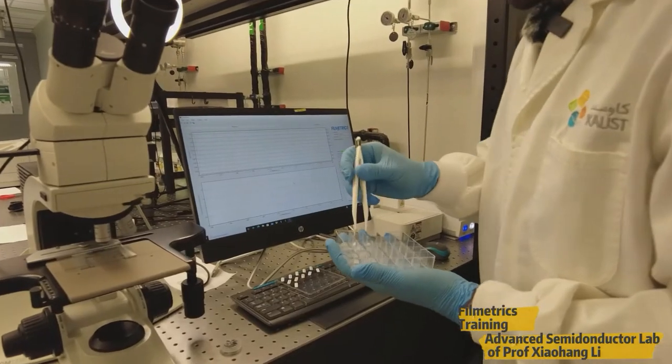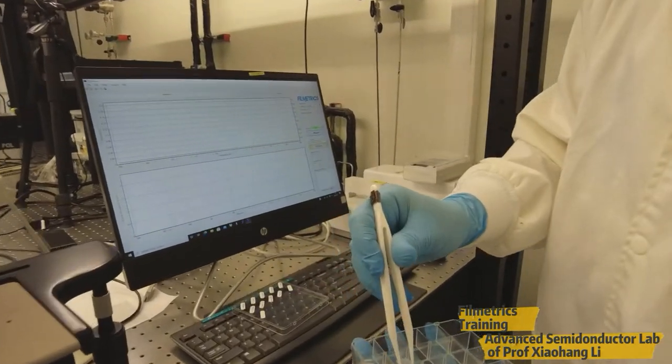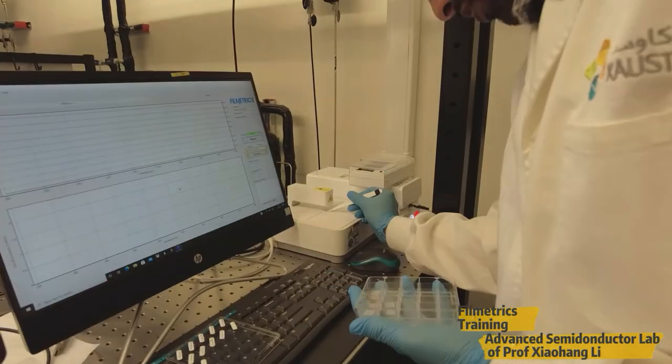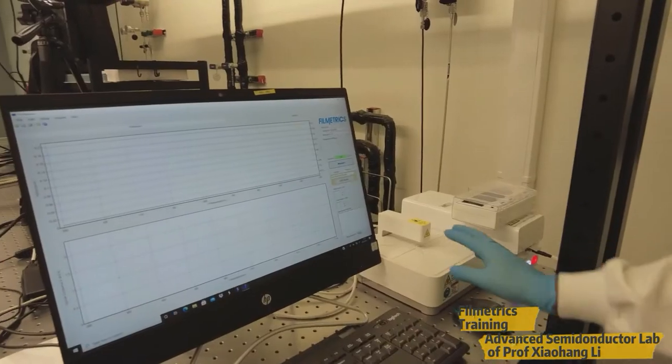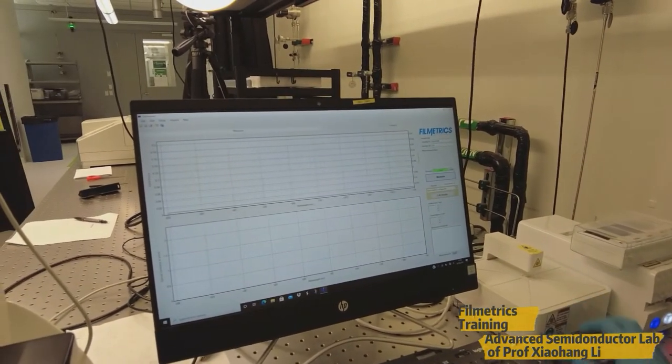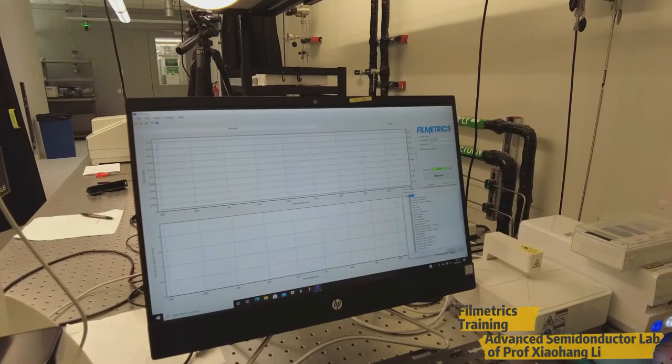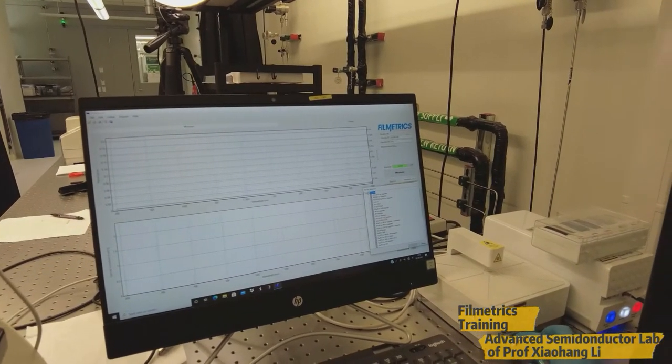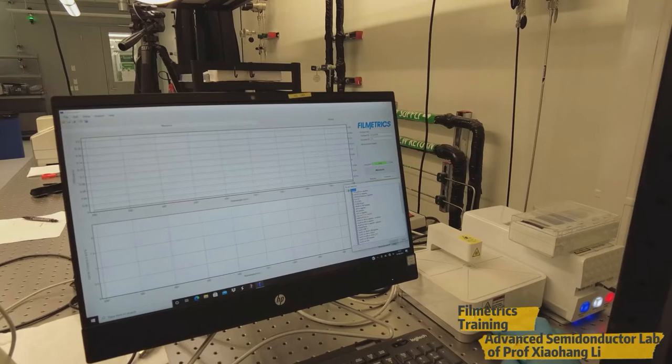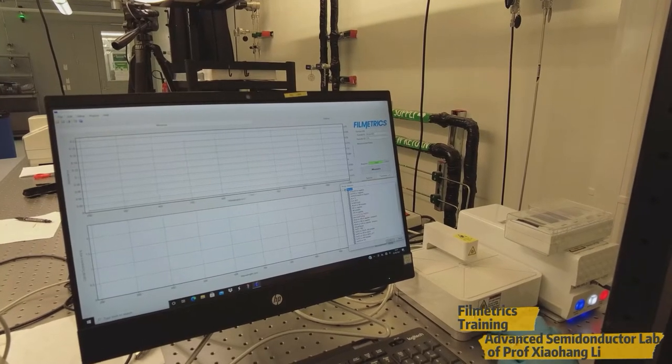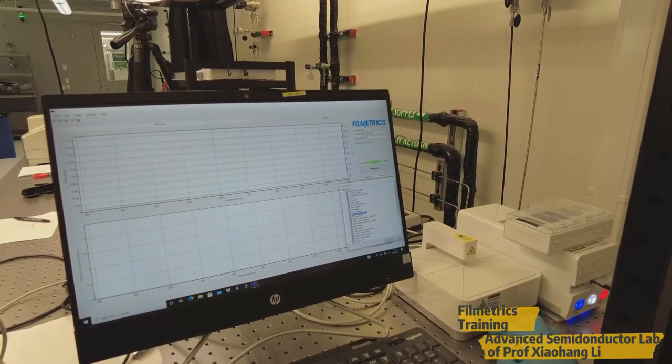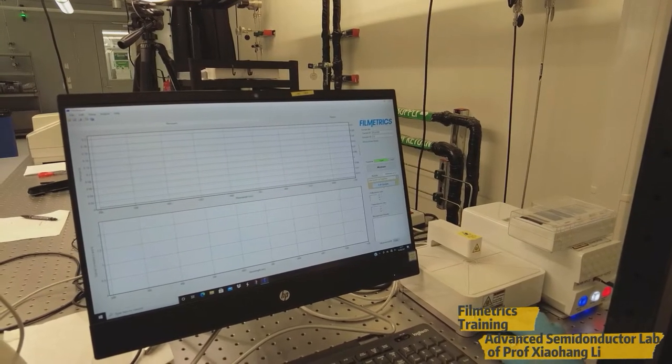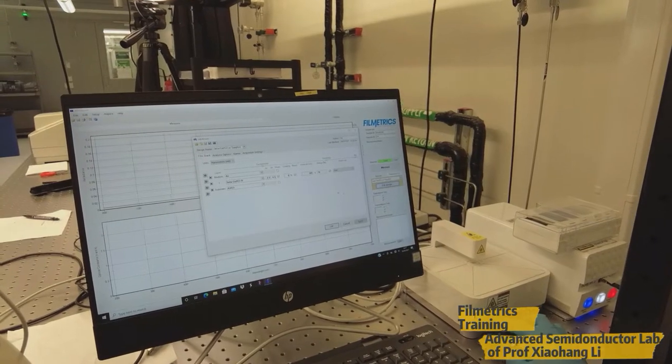So this is a one by one sample, which I have. So I'll be going to place this sample here. Now this sample is gallium oxide grown on sapphire. So I have to select a specific recipe for specific sample. So here we have already one recipe for gallium oxide on sapphire. So we will choose this one and we can edit the recipe from here.